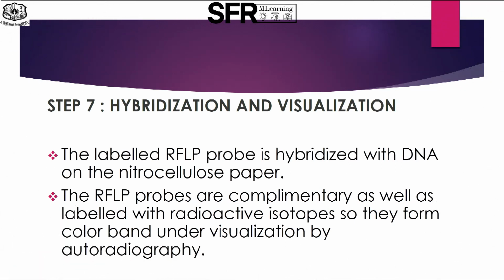Then the last step is hybridization and visualization. The labeled DNA probes are hybridized with the nitrocellulose paper. The RFLP probes are complementary as well as labeled with a radioactive isotope, so that we can easily observe the bands under visualization with the help of autoradiography.